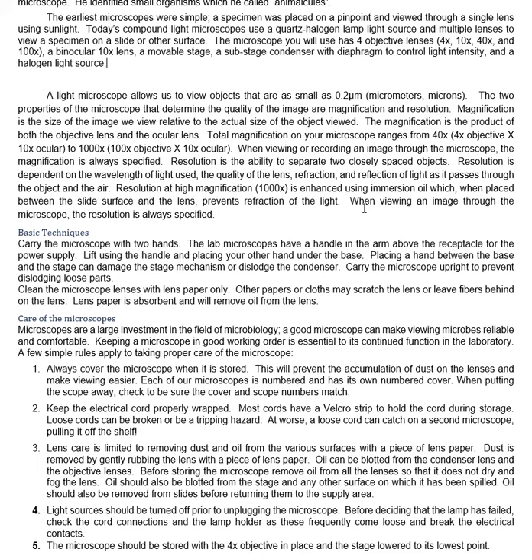Now, a light microscope will let us look at something that is as small as 2/10 of one micrometer across. A micrometer is 1/1,000,000th of a meter, super tiny. But they have to be, because if they're any smaller than that, it's going to kind of all run together for us. It has to do with resolution.